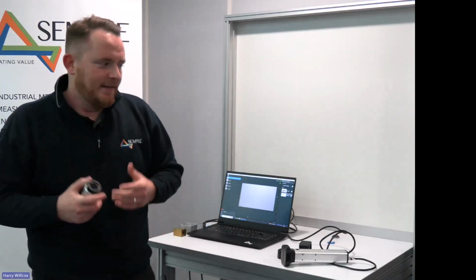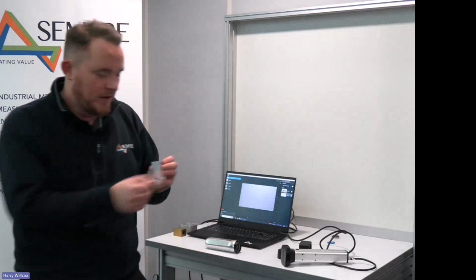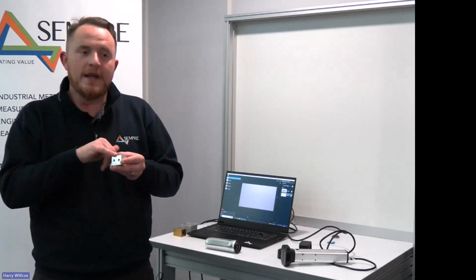The next one I was moving down to is how long do the Gelsight pads last for? It's a slightly subjective answer. It sort of depends what you're doing. If you were measuring samples like this one here, looking at step height changes and radiuses and potentially the roughness, I'd be looking to get our customers to measure maybe 200 scans per pad. If we were looking at break edges, or debris that was left on components, we might be looking at between 100 to 175 scans.